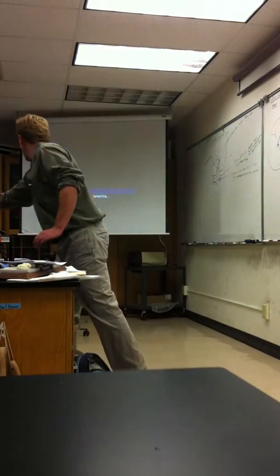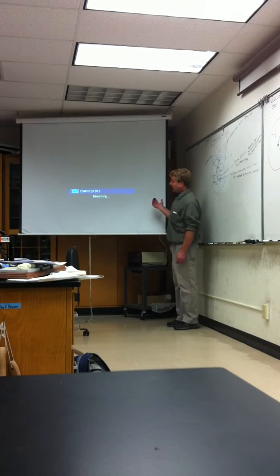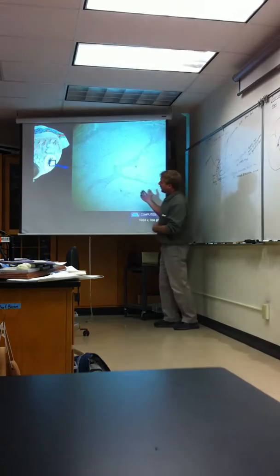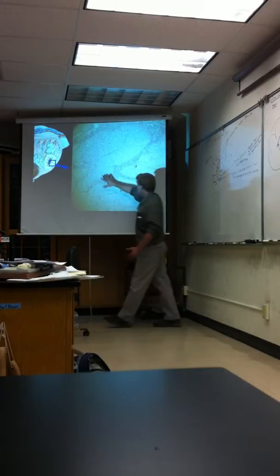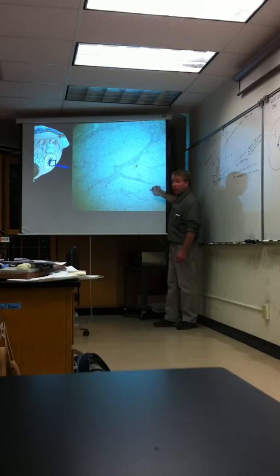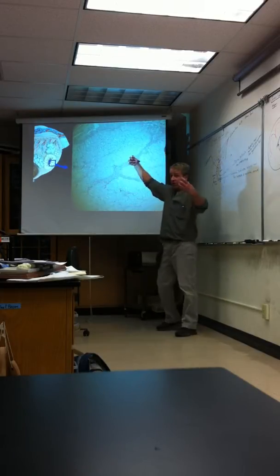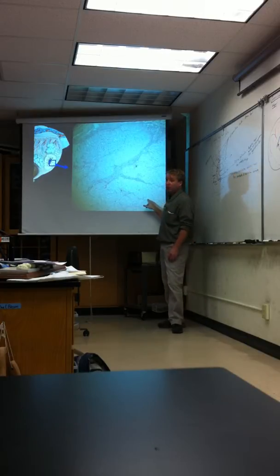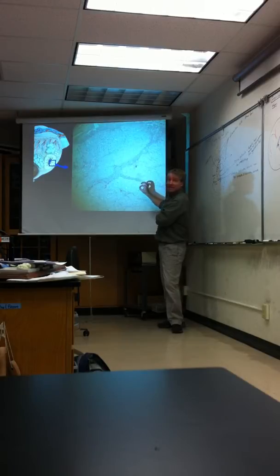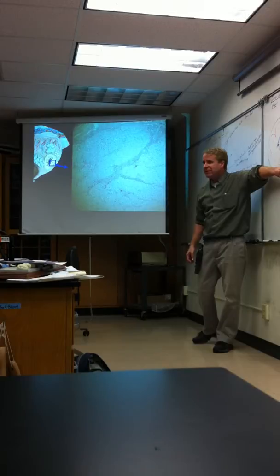Let me go back to my view here. Notice then the model, and they try to show the model pretty accurately, where the model is showing these little folds. These folds are actually, you can see right here, a little fold right here. And you can see the fold right there. And the reason is because this huge mature follicle basically collapsed. When it collapsed, you would have these folds. But this is the corpus luteum slide. There are two main cells within it. There are the darker cells called the theca lutein cells.